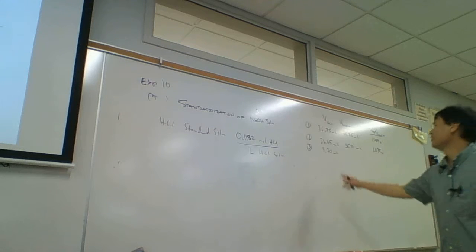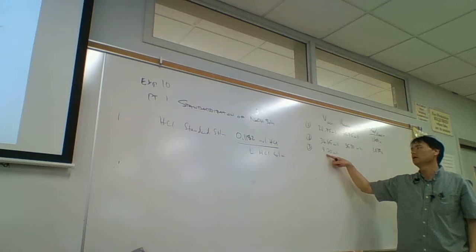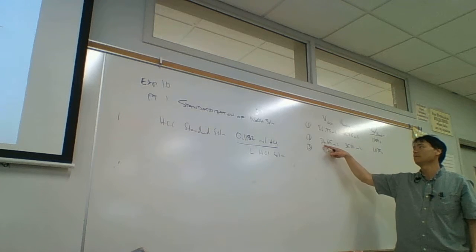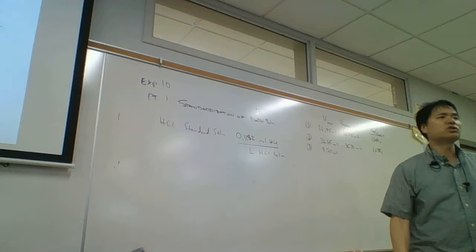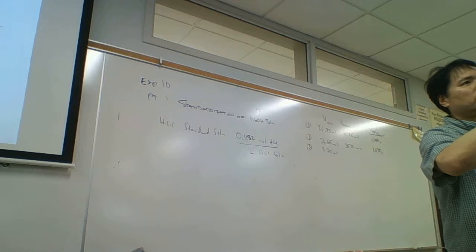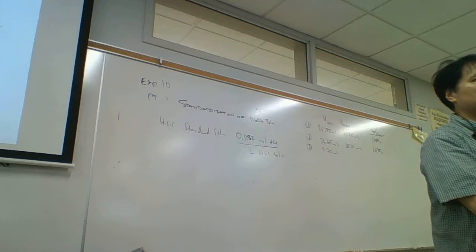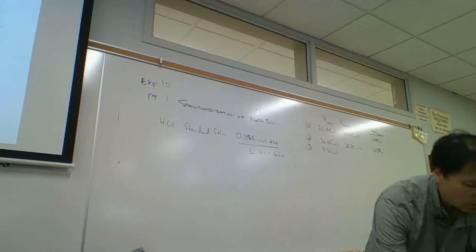If you only use 9.7, a 1 drop error is proportionally much larger than a 1 drop error in 36.65. In titrations, most people shoot between 35 and 50 milliliters, which gives you less error and better results. So 9.7 is a little low.